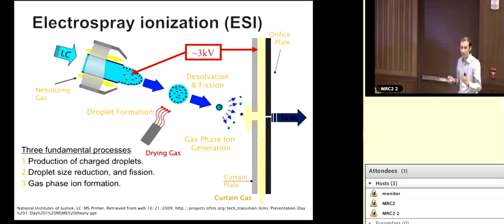Okay, very briefly on this hyphenated technique thing. Why not just do mass spec? Why put LC on the front? Well, LC, as Steffi will tell you, is good at separating complex mixtures. More about that soon. But it can be difficult to identify components from a chromatogram alone. Mass spec can determine the mass of molecules and is useful for identifying them, but signals from multiple components are difficult to differentiate where they're coming from.